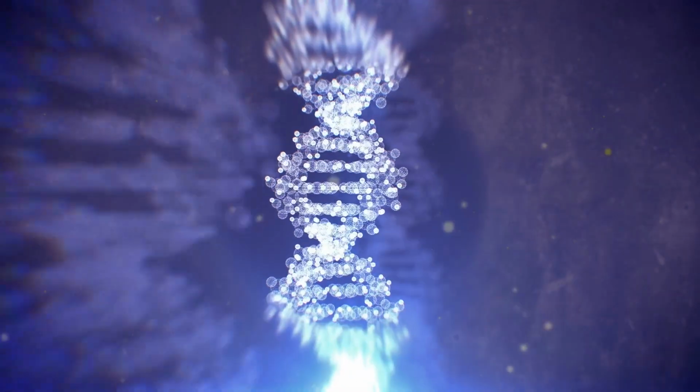I think one of the biggest advances in recent times has been in microfluidics. So that has really enabled us to separate individual single cells in a high throughput manner, and then to do genome sequencing and transcriptome sequencing.